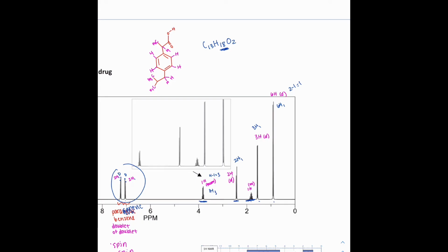So that is a way to determine it and work your way through it when you're given the proton NMR, because you know that it is 1 hydrogen and 3 neighbors, and that's the only place that really occurs, and that is more electronegative. So then moving backwards, we have this 2 hydrogen situation with 1 neighbor.